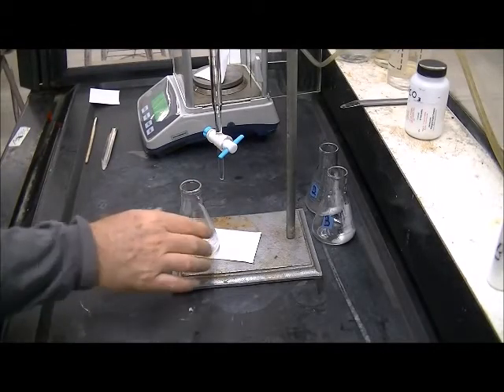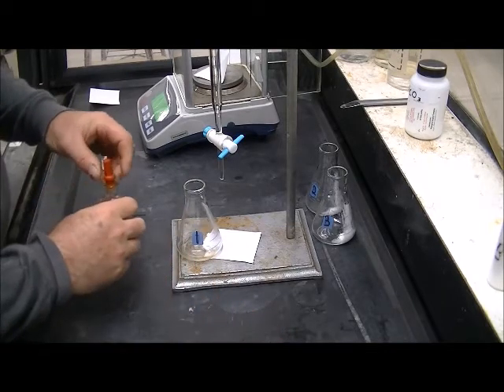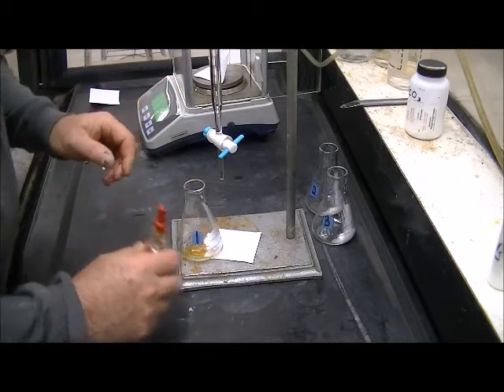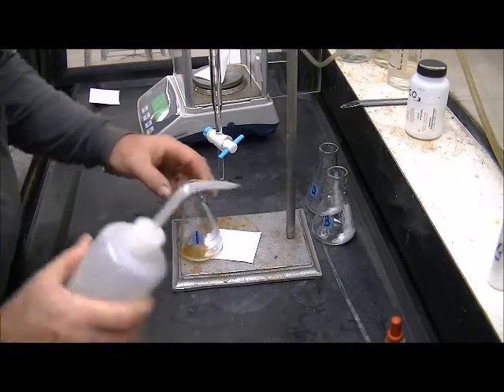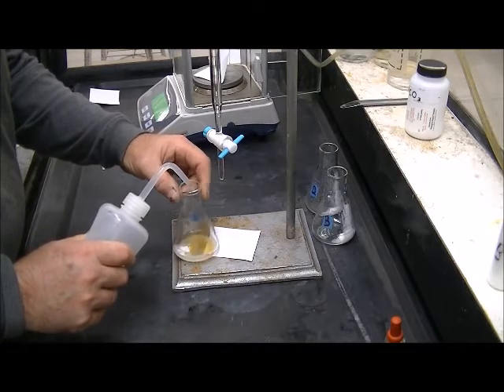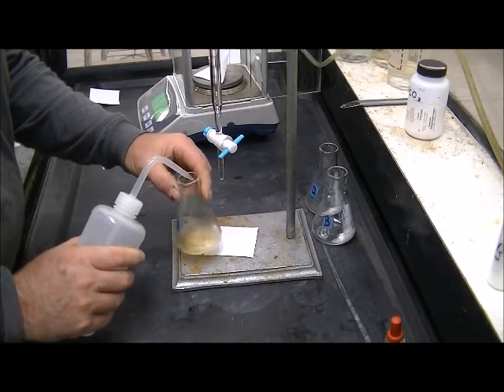This is the first sample for sample A, unknown A. I'm going to put in three drops of our indicator. And some water to help dissolve the solids. And make sure they're all washed down to the bottom of the flask.